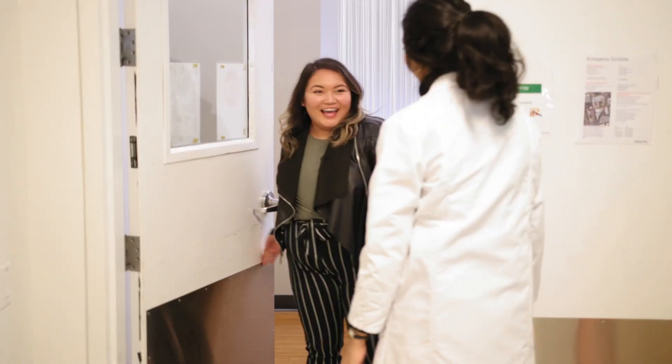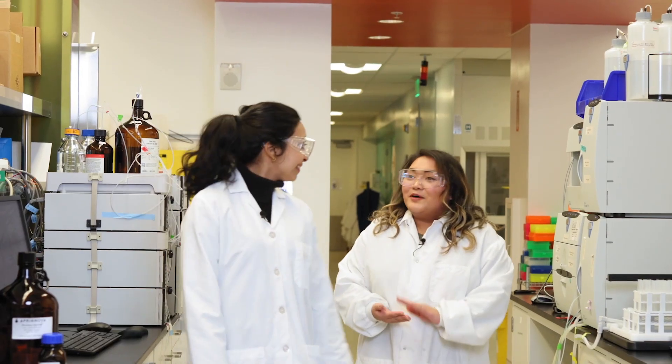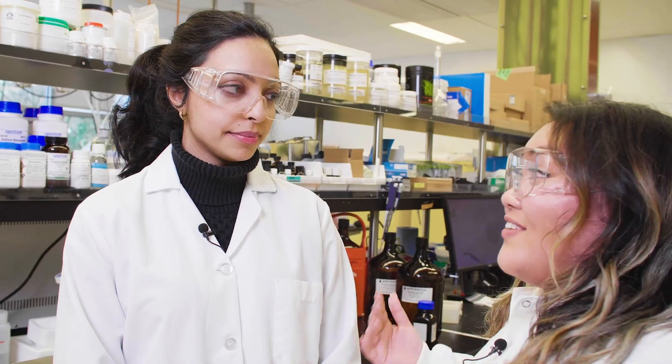Hello, Marilee. I heard you're looking for me. I'm all suited and ready to go. Welcome to our lab. Oh my god, this is so different than the computers and offices upstairs. So I obviously know what you do here, but for the viewers out there or anyone who's new to our brand who may not know exactly what you do, can you tell us what you do here at BioSauce? Sure. I work in the product development team, and I formulate our products.